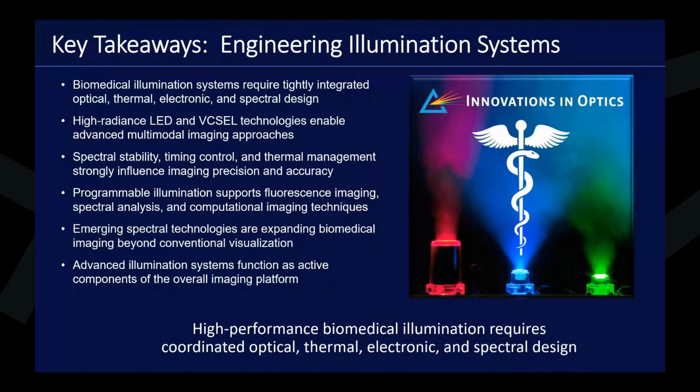More broadly, illumination systems are evolving beyond passive light sources toward actively controlled subsystems integrated directly into overall imaging platforms, directly influencing image acquisition, analysis, and image-guided procedures. Ultimately, high-performance biomedical imaging illumination depends on coordinated optical, thermal, electronic, and spectral engineering across the entire imaging system.